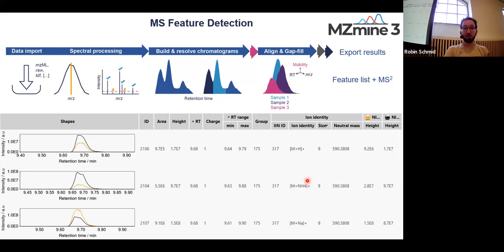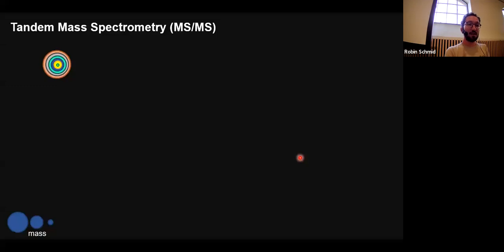And so just to wrap up the processing in MZmine, we're going to produce a feature list, and it's going to look somewhat similar to the one on the right side, where we're going to have some charts to look at the quality of the peak picking and maybe alignment. Then we have some other columns here with annotations and parameters that are being calculated, but Stefan is going to guide you through here.